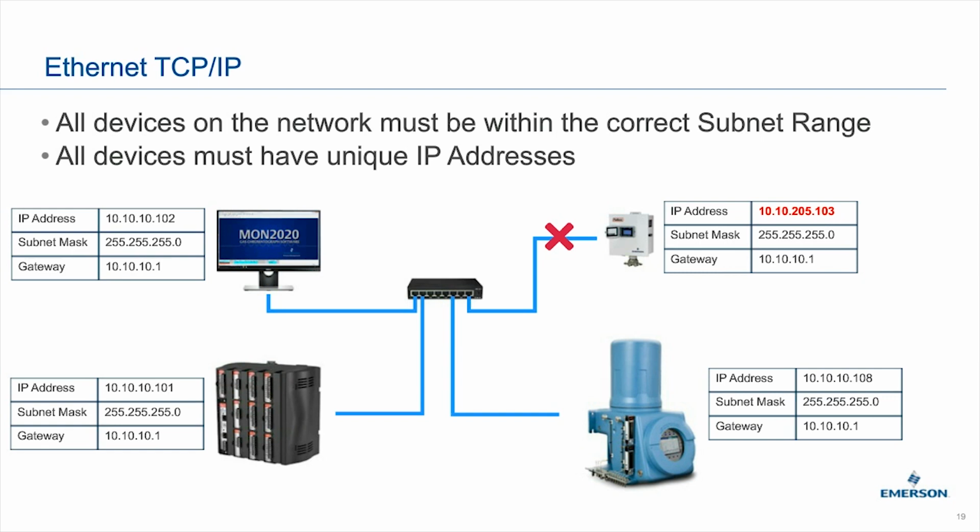I got a question here. Does the GC also have a MAC address? All Ethernet devices have a MAC address, but that is not something that we use in typical Ethernet communications. It's not something that we configure, and it's not something that we actually use.